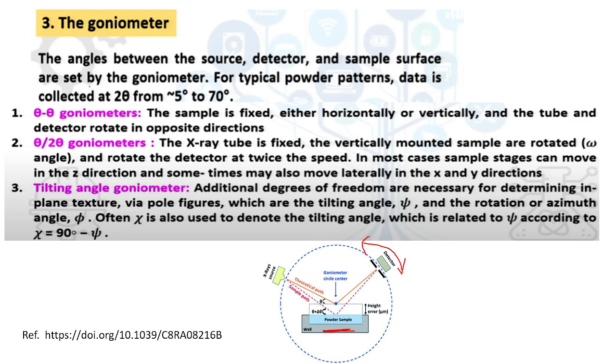For X-ray we don't need any lens, because it has the same index for glass or whatever it is, it will remain the same, and it is neutral. X-ray is not any charged particle, so it will not be refracted by changing the medium through which it passes. That is why we can change the angle of the sample holder or detector or the X-ray tube. Is it clear?